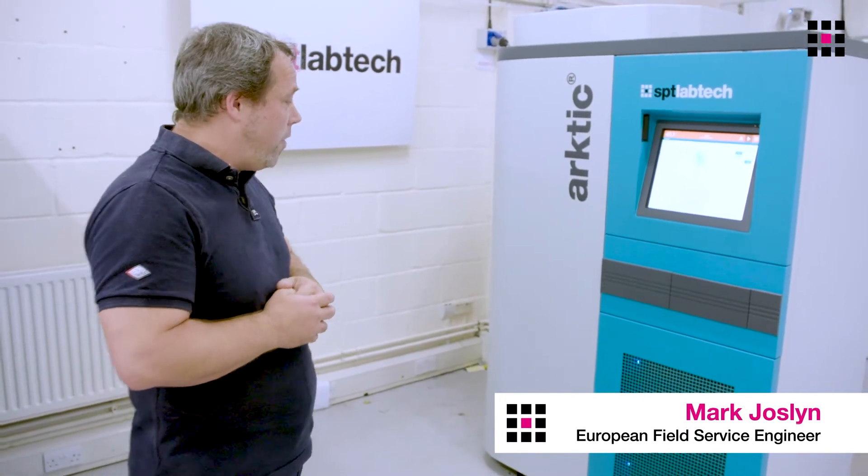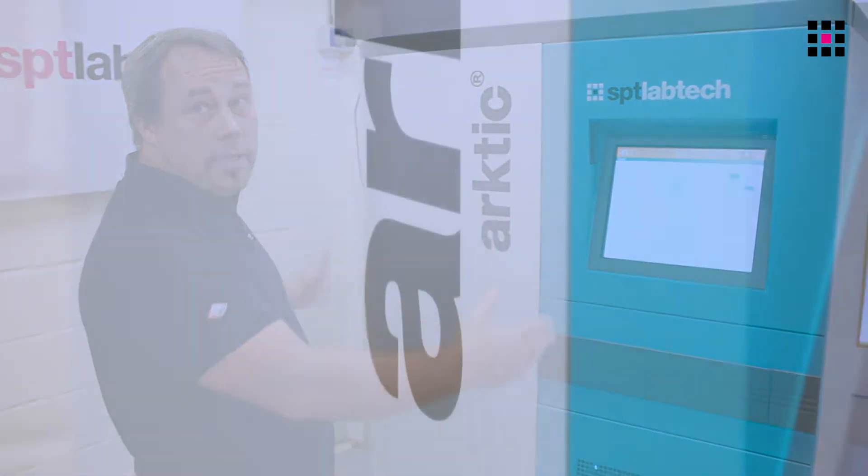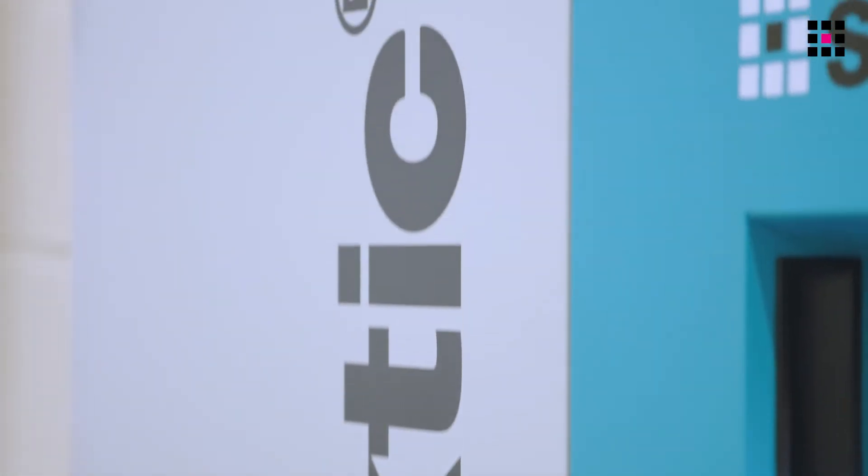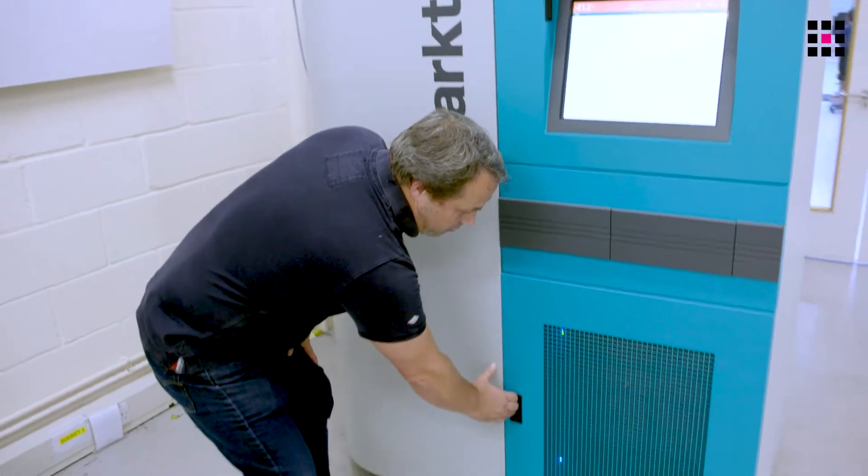If we start off from the front of the machine, you have a very compact module system. Part of the Arctic is that it's minus 80, so we have refrigeration systems on here. We have two refrigeration systems.